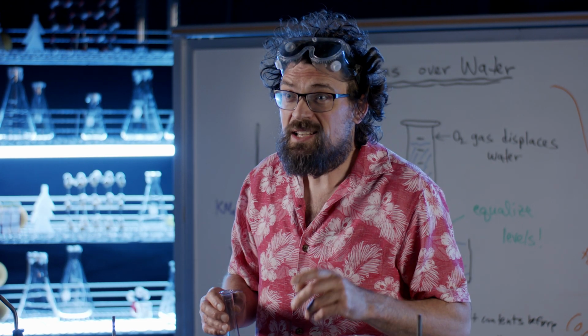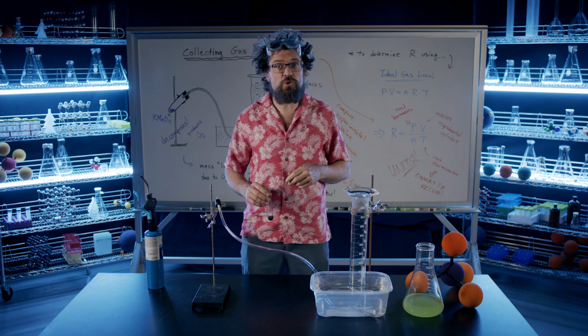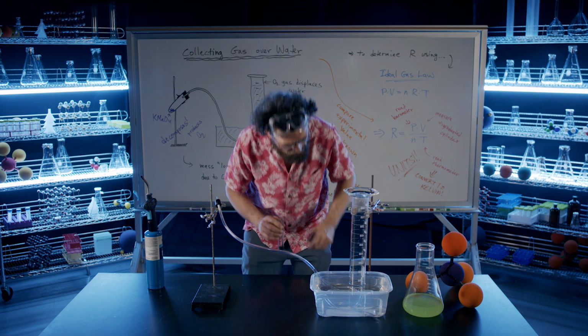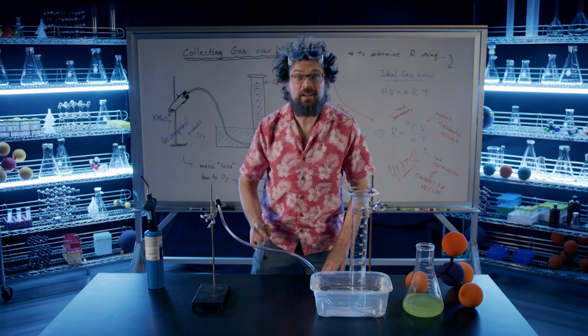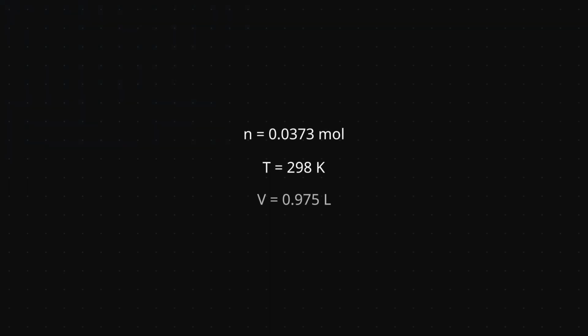We determined this by reading a thermometer. It was 25 degrees Celsius, that's 298 Kelvin. We can measure the volume of the gas using the gradations on the cylinder. Looks like it's about 975 milliliters or 0.975 liters.